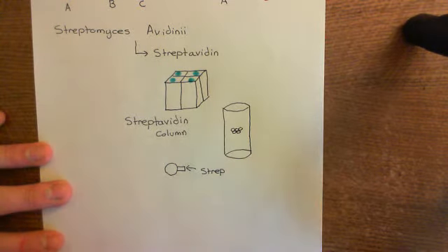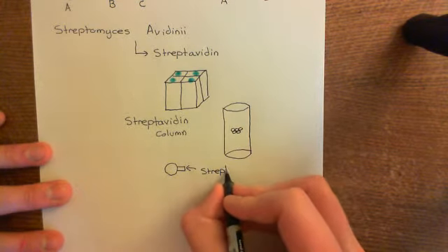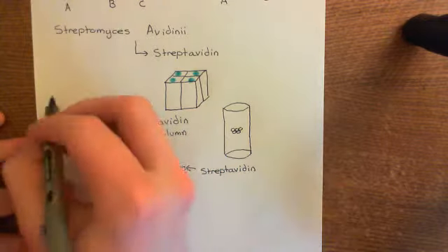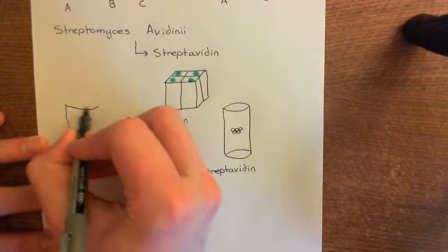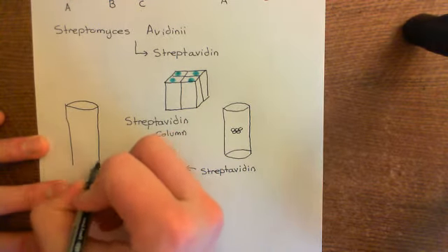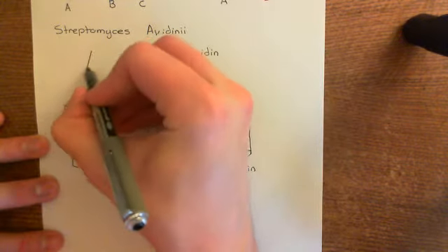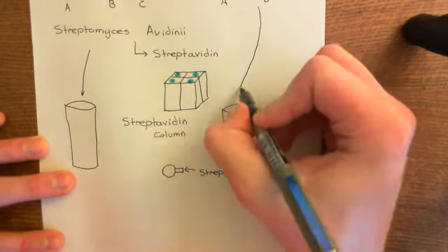our control sample and our hydroxylamine sample, through the Streptavidin column, and we'll have 2 separate Streptavidin columns. We'll have one for the control over here, and we'll have one for the non-control. Okay, so this is the control column over here. Right, so we'll pour control through one of these, and we'll pour the non-control through the other.